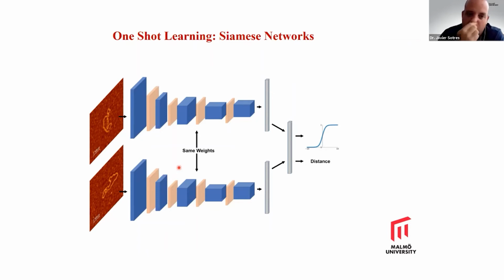Imagine that first we have focused on this molecule, and then we zoom out, and we want to compare all the molecules detected with YOLO v3 to make sure that we don't focus on the same molecule. So the output of YOLO v3 goes to this type of structure where we have two convolutional neural networks, actually the same shape and same weights.